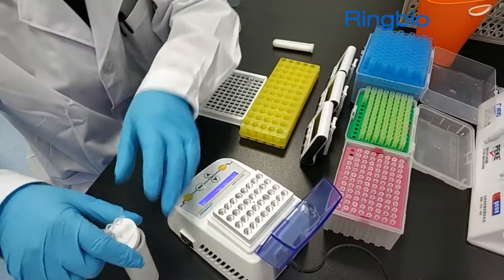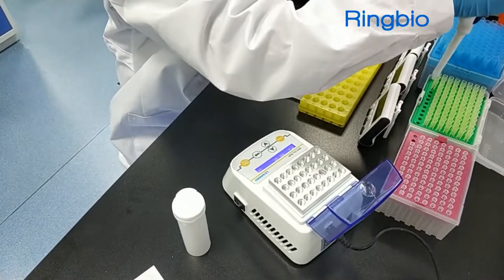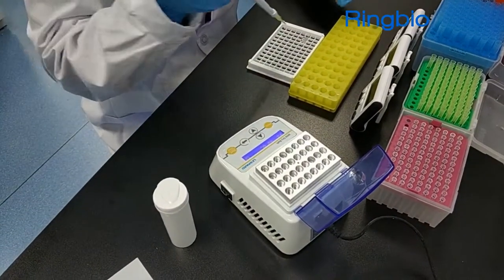Place the microwell reagent on the plastic tray provided in the kit and add 200 microliter milk sample with micropipette into the wells on the tray.